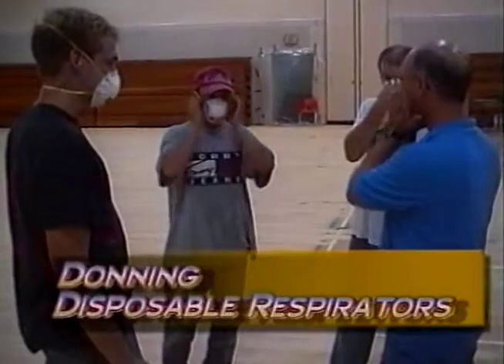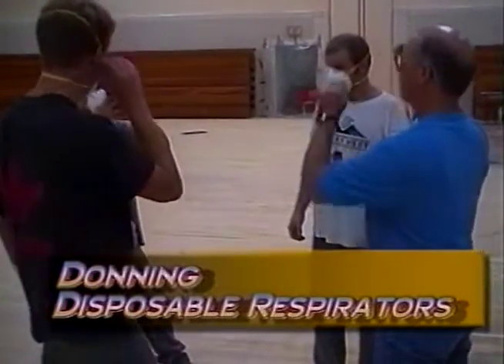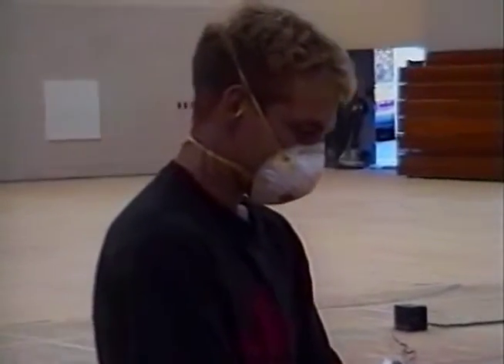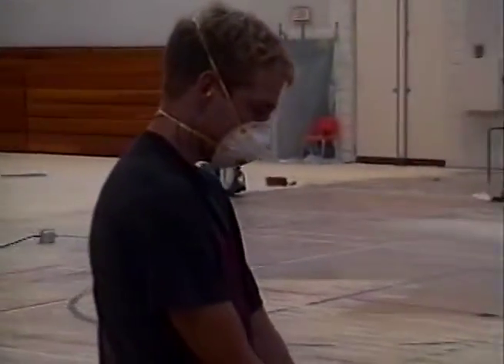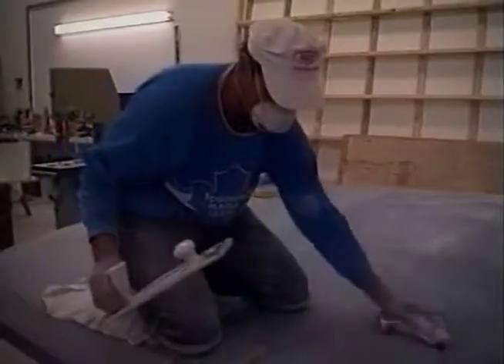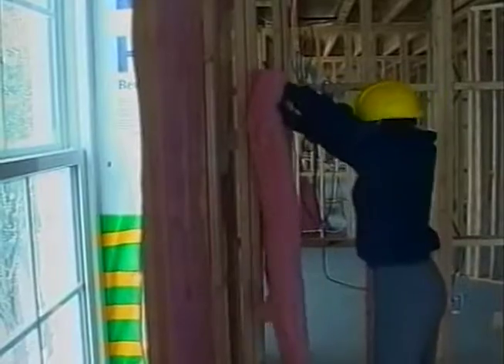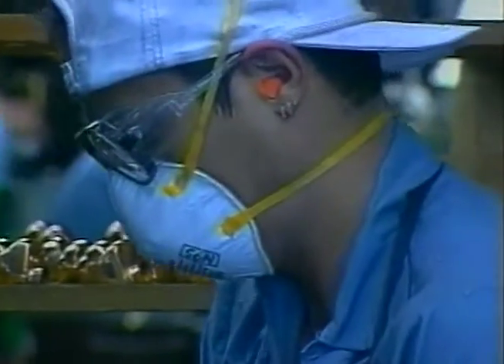The proper donning of this type of respirator is essential to ensure adequate protection from airborne contaminants. Workers who are required to wear a respirator in New Brunswick must by regulation be as clean-shaven as necessary to ensure an effective facial seal. If a facial condition prevents the respirator from seating properly on the face, air may leak around the respirator and not be filtered before reaching the lungs. If this occurs, the respirator must not be used until a proper seal is obtained.